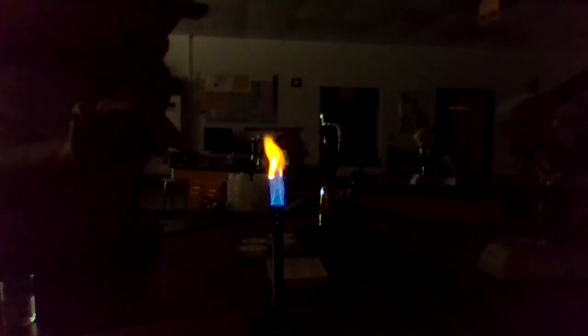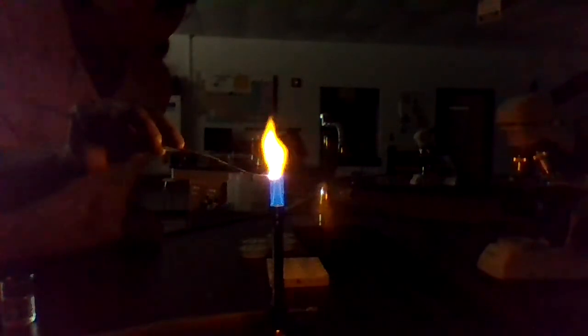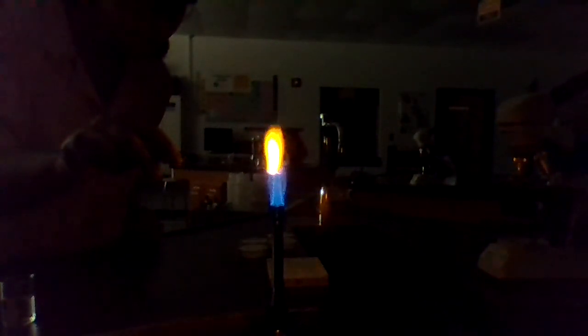So we'll do it again. Sometimes you get a little wispy blue coming off and then deep greens in the middle. I think they can see it. Yeah, the wispy blue smoke coming off of it. It's really kind of cool. You can definitely see the green and the deep green on the edges there. This one's a little harder for a lot of people to see because it's a lot of yellow, but the yellow is not the real color.